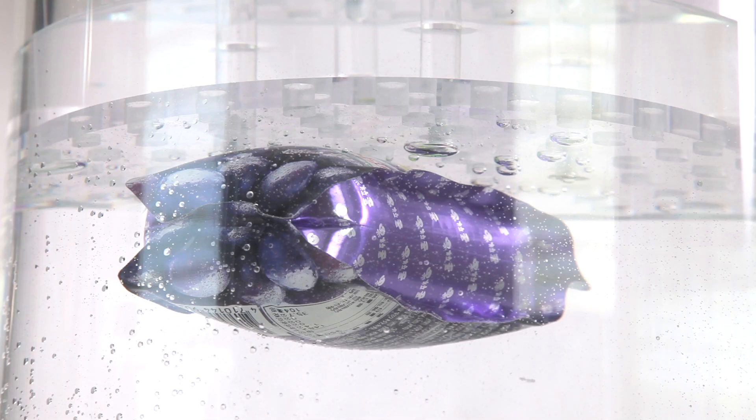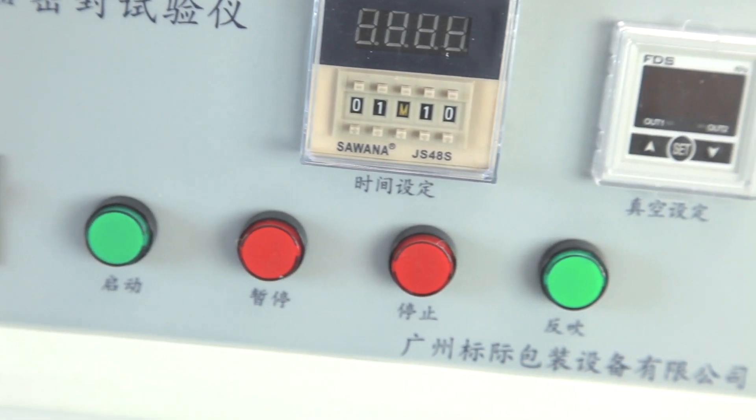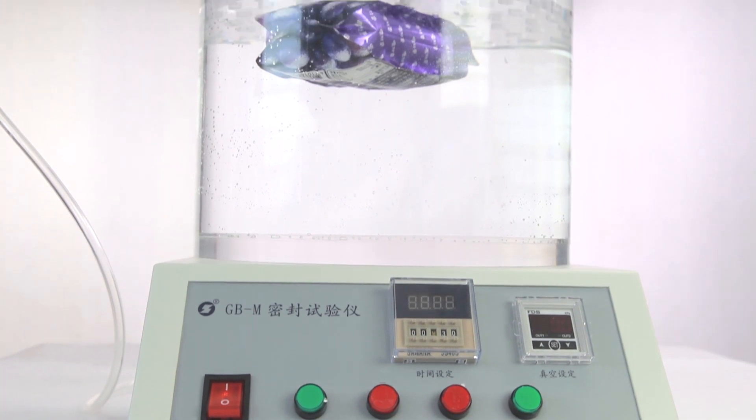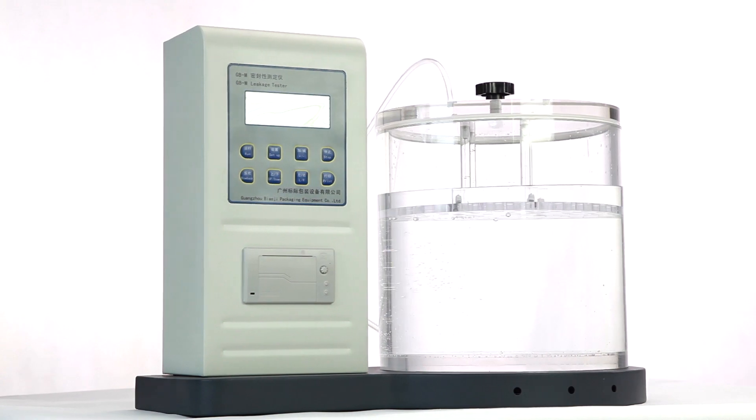It's used to test the leakage stages of sealed packaging bags, bottles, cans and so on, used in the industries of packaging, food, beverage, pharmaceuticals, personal care and so on.